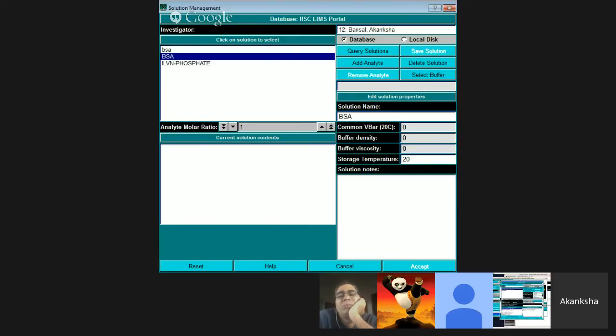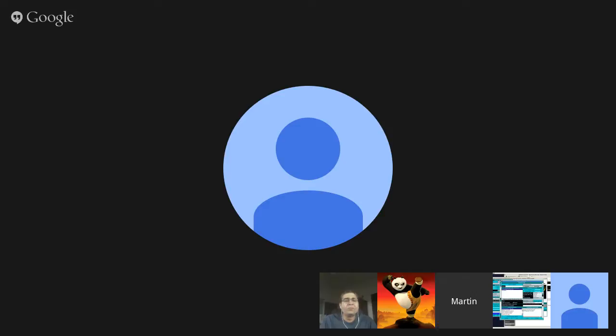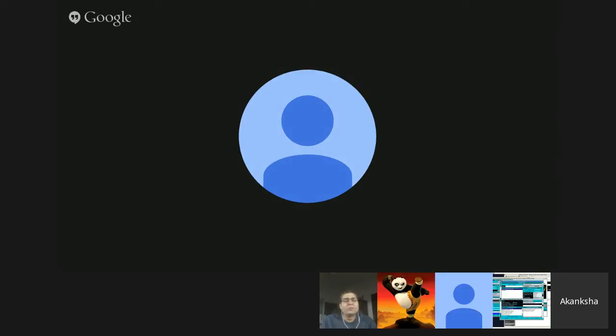Okay. So I'm on the buffer database portal. Can you repeat that? Can you see it now? The buffer management area. No, you may have to share your entire screen rather than just a single window, because right now it's not pointing to anything. Okay.